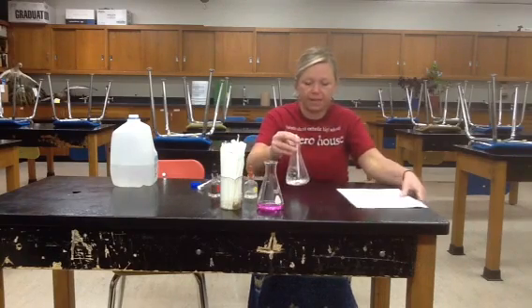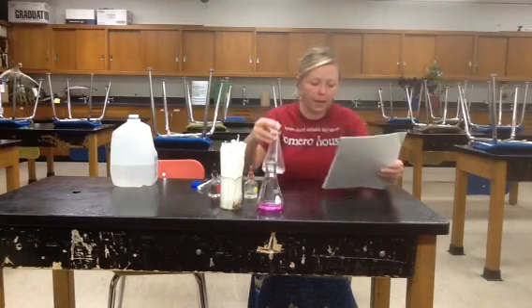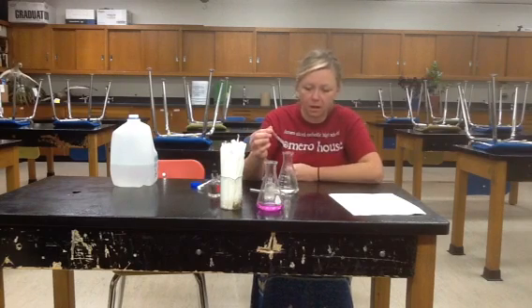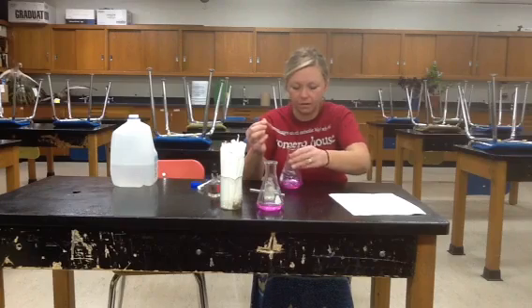Okay, so let's just say that's been about 20 seconds. It's clear again, the pink's gone away. Then what we're going to do is add the sodium hydroxide drop by drop, making sure that you keep track of the number of drops that you put in until we restore the pink color again. As you're dropping, you're going to stir. So it only took one drop that time.